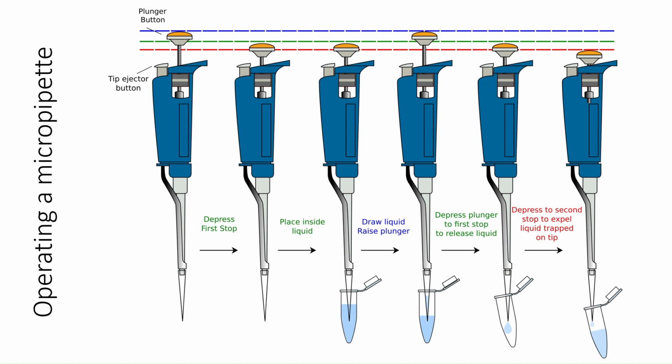So the thing you want to be really careful about here is our plunger button, the white knob that you can turn to set the volume. So it has essentially 3 different settings where it can be. It can be fully out or fully up, which is shown here on the blue line. That's how it is most of the time, unless someone is pushing on it.